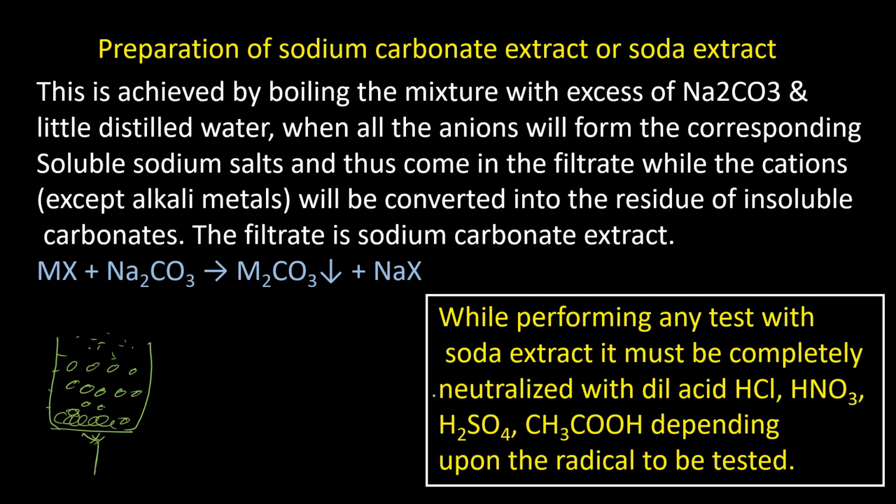Now remember, when you are doing the test with sodium carbonate extract, first you have to neutralize with the acid, either hydrochloric, nitric, sulfuric or acetic, depending on the acid radicals. Because sodium carbonate is alkali, your solution will become alkaline. So first you have to neutralize it before performing the test.